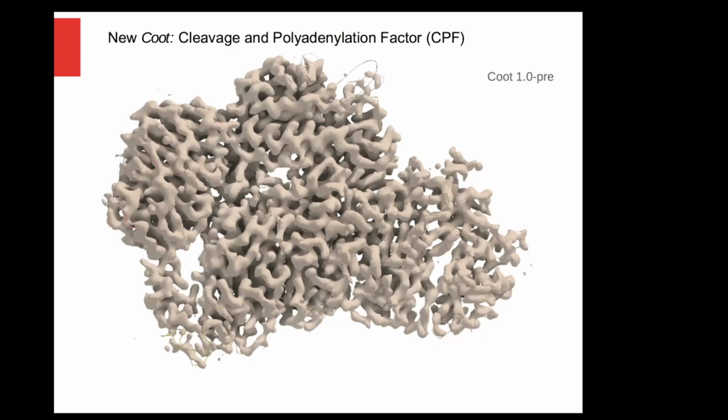If we did a side-by-side of this, we could see that it's quite close to Chimera, but I think most people would, including myself, especially with a number of structures, give the tick to ChimeraX in terms of interpretability due to ambient occlusion. But this is not bad, and a certain improvement over where we used to be.